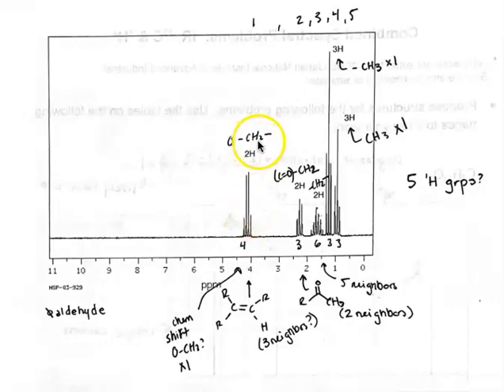So 2 of our hydrogens are going to be around 4 parts per million, and that is marking the hydrogen right here, CH2, of a hydrogen that is attached to a carbon with an oxygen as a neighbor. We have 2 hydrogens that are attached to a carbon that neighbors a double bonded oxygen carbon pair. So right here, these 2 hydrogens are right here. So over here we have 2 hydrogens with 5 neighbors, that are going to be bonded to a carbon hydrogen pair on each side.